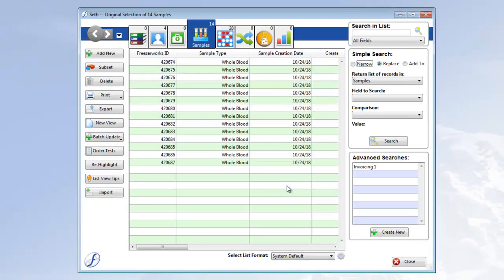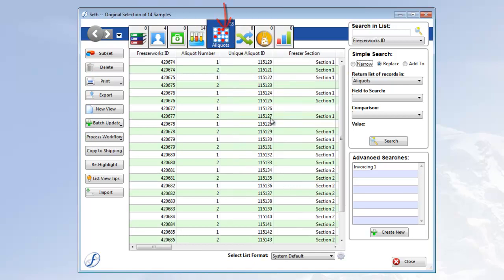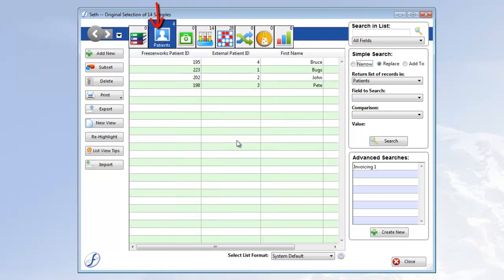And now that we're on the list view, I can click the aliquots tab to see the actual aliquots I scanned, or the patients tab to see the patients the aliquots I scanned belong to. Whatever I want to do with the selection, I can do using the list view.